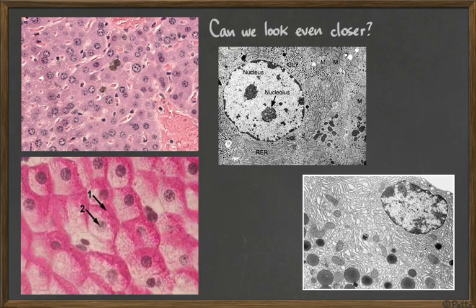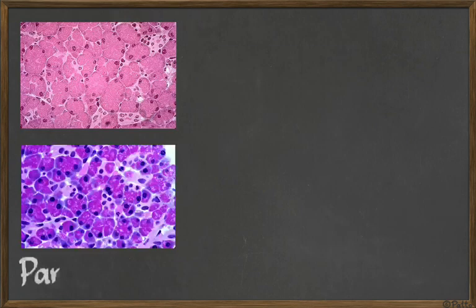If we use another kind of microscope, this colored one on the left is an optical transmission microscope. And this image here in black and white, they are using a different kind of microscope. They are seeing things in even more detail. This here is the nucleus that you saw before. This here, the pieces of chromatin within the nucleus over there. And here we see even more structures inside of the cell because we are magnifying it even further.